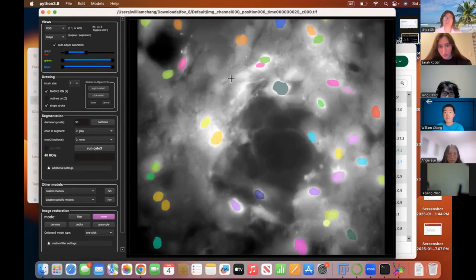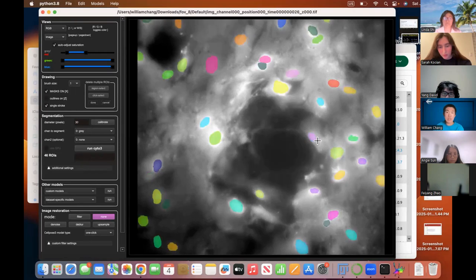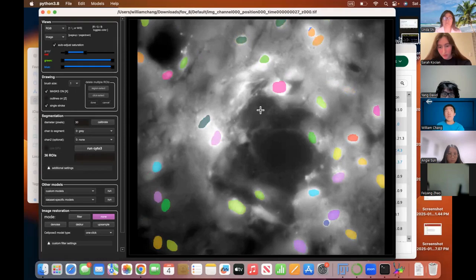So this was some of my previous work in masking cells. You can see a lot of these masks, and the central dogma in this is that the more the better. The definition of deep learning and machine learning is that once the computer has picked up some principle of what you're trying to do, you continuously feed it more information that you want it to process, and slowly the machine will pick up on the correct regions.